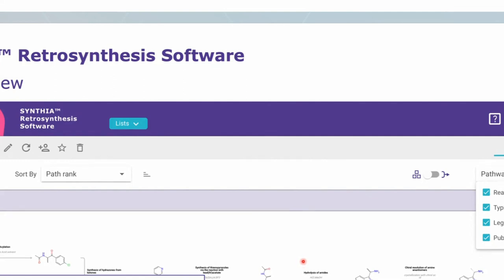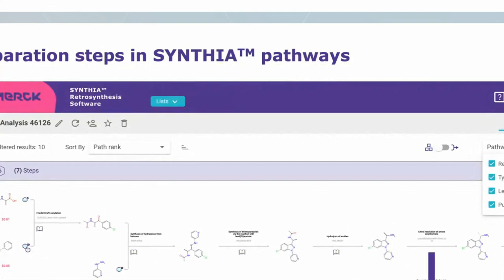Additional possibilities that SYNTHIA offers include downloading the pathway in PDF format and sharing the pathway with other SYNTHIA users. One of the very new algorithms recently added is an advanced algorithm that predicts chiral separation steps on the pathways. SYNTHIA identifies structural motifs that can be separated and includes such steps in the predicted routes.